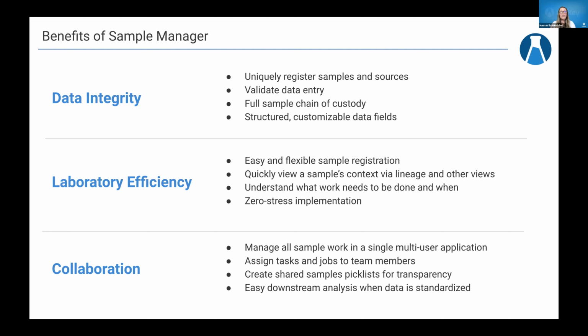And then providing that framework for downstream analysis. So the more standardized and the more structured your data is, as flexible as the system is, we do want it to be structured. So if you want to make reports and analyses downstream, you really have that option, and it becomes very easy to work with other teams.